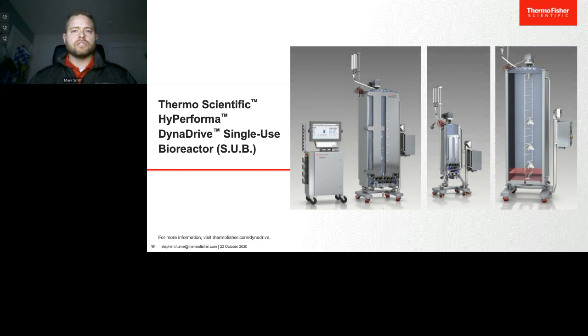In another example of using the low turn down, we used low turn down in a 5,000 liter, where we did an N-1, N-2, and the final fed batch stage all in a single BPC, or bioreactor container, or bioprocess container, I should say.